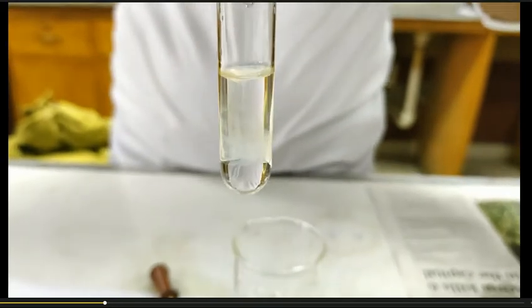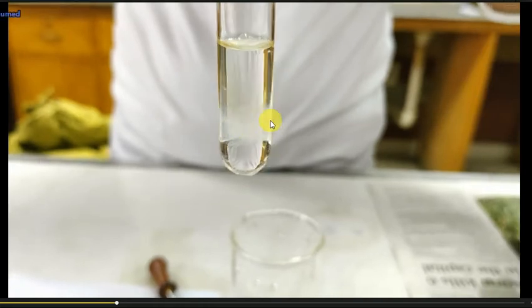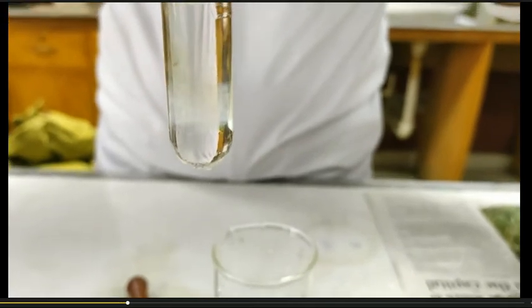The PPT will dissolve. You can see that this is the white PPT formed by the addition of sodium hydroxide. This white PPT is due to the formation of zinc hydroxide, produced by the reaction of zinc with sodium hydroxide. When excess alkali is added, the PPT dissolves.